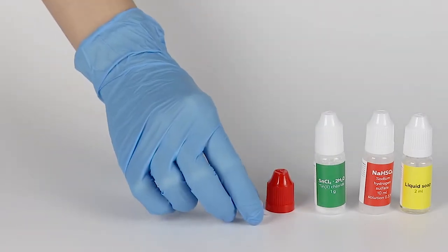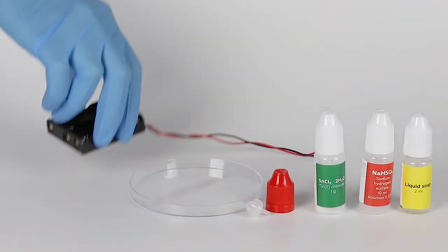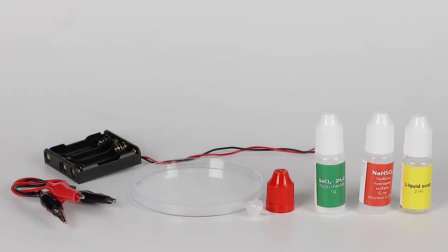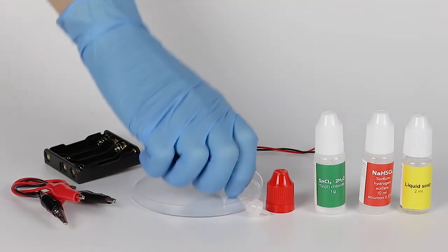For the Tin Dendrite experiment, you will need liquid soap, sodium hydrogen sulfate solution, tin chloride, a red cap, a tip, a petri dish, a battery holder, and crocodile clip wires. Prepare four AAA batteries in advance.